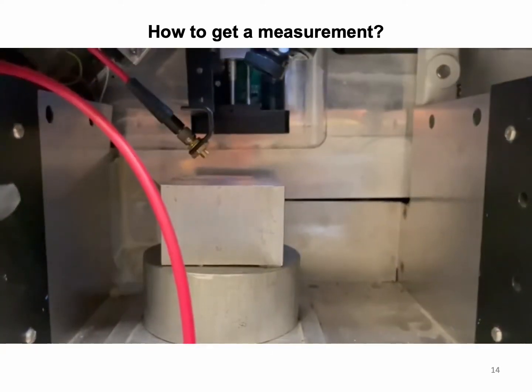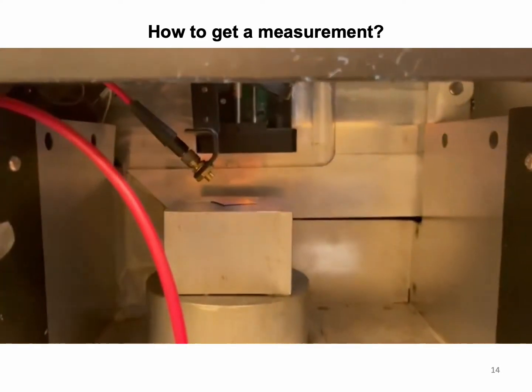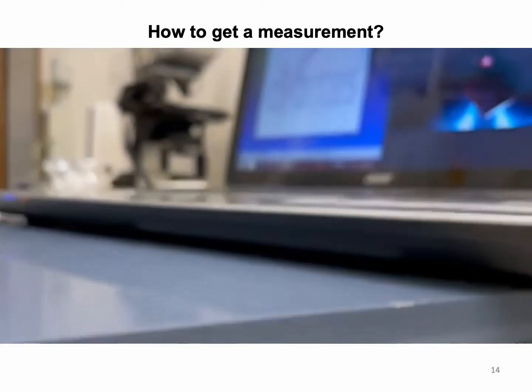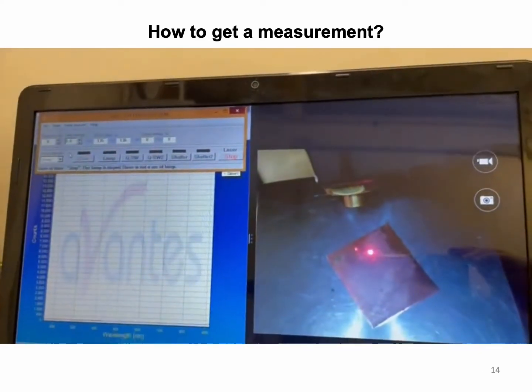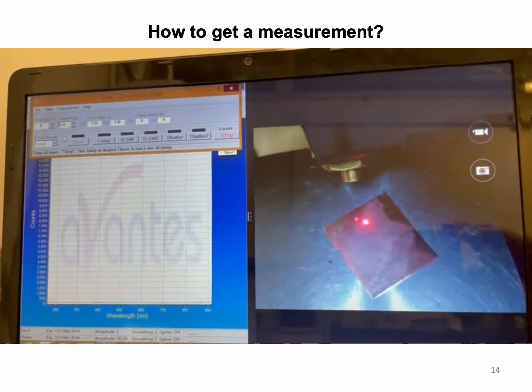As a simple case study, we have chosen a copper foil. The foil is placed in the sampling chamber near the fiber optic that collects the plasma light. The focusing position is adjusted until the two red spots coincide.